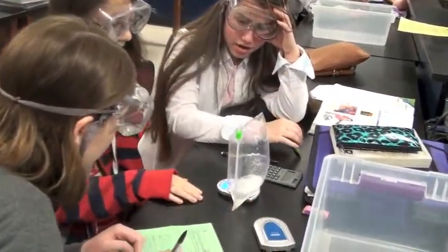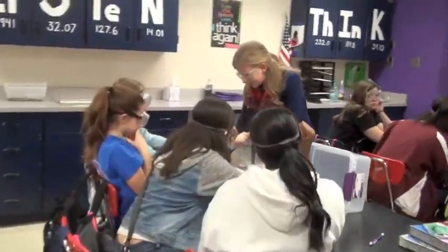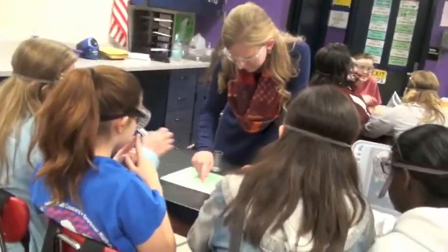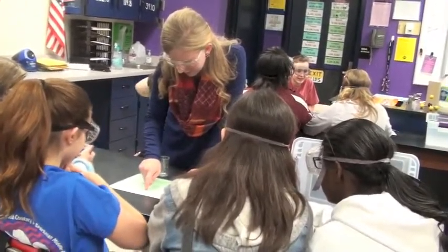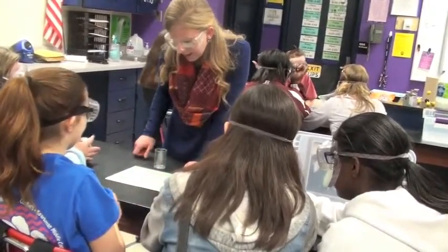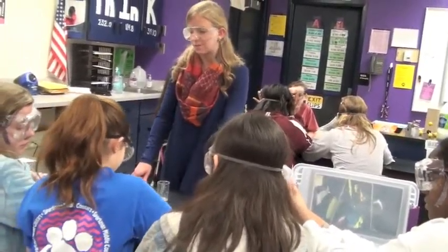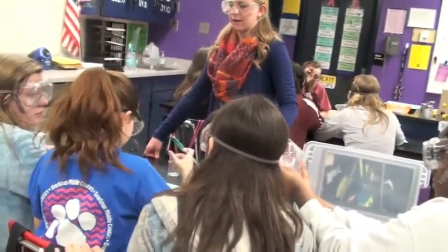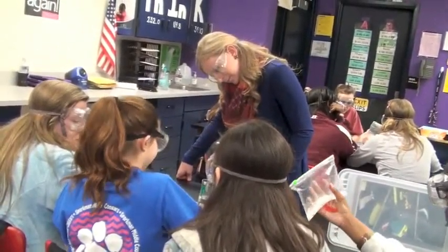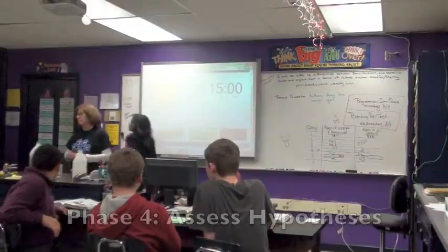Yay! Wait, was I right? No, you were right. Yay! That's good. No, I'm sorry. Did you weigh this? Yeah. Okay. So what was the weight? Because the air has mass.